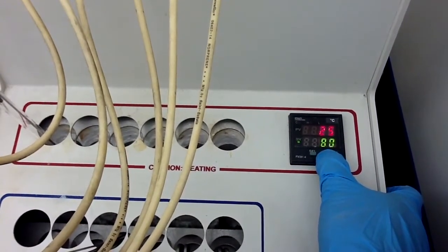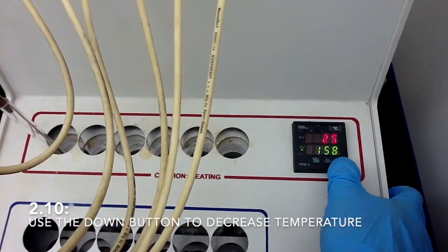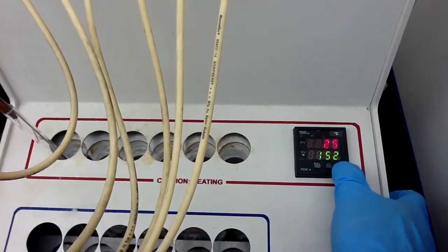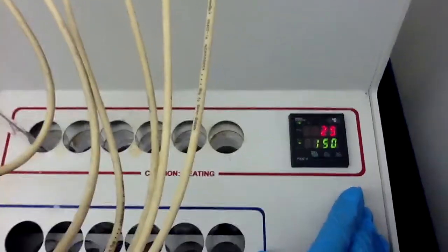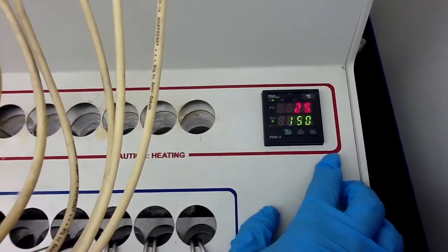So it's increasing. Oh, okay. So we can also decrease it. Suppose this is the 150 degrees Celsius temperature we want. It will take some time, maybe 5 or 10 minutes. After that it will reach 150 degrees Celsius.